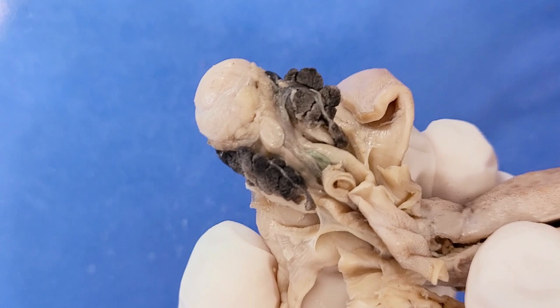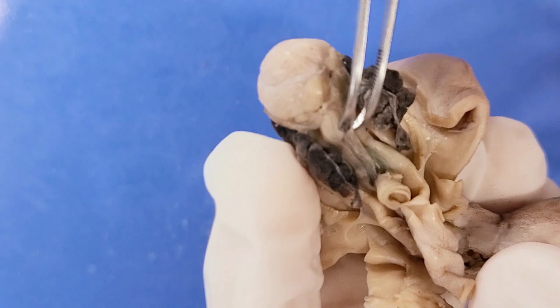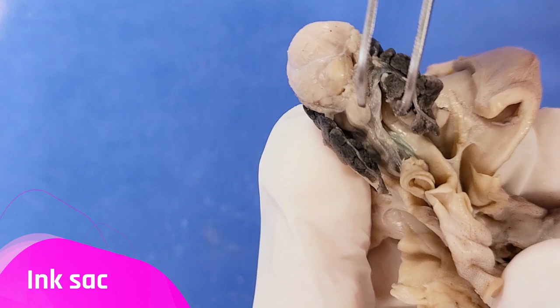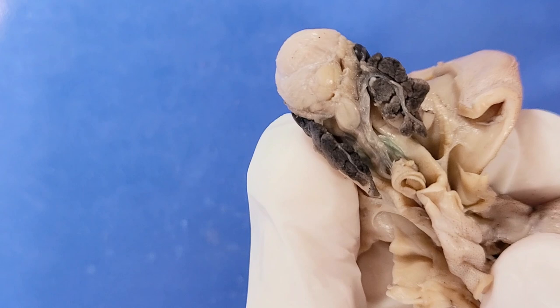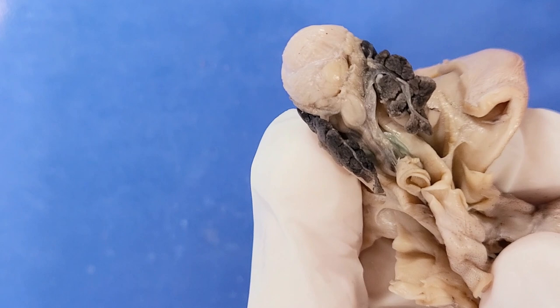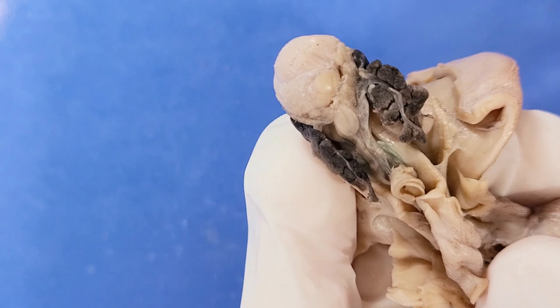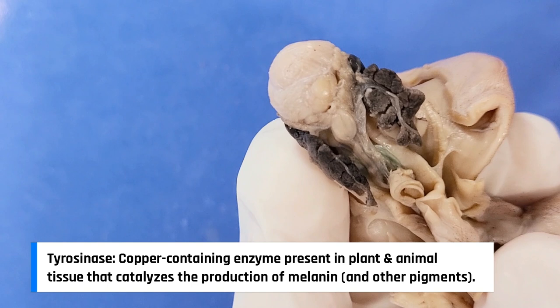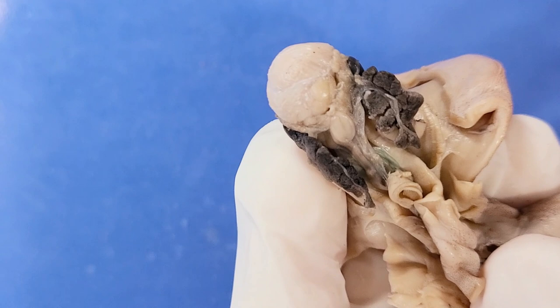Now I want to point out this dark structure here. So like this dark line next to the intestine right here. This one. And this is the ink sac of the octopus. Octopuses eject ink from their ink sac to distract predators while they escape. This ink is made of concentrated melanin, which is the same pigment that we humans have in our hair and skin. But the ink also physically harms enemies. It contains a compound called tyrosinase, which causes a blinding irritation when sprayed in a predator's eyes, and also confuses the sense of smell and taste of the predator. In fact, the ink is so potent that octopuses that do not escape their own ink cloud can die.